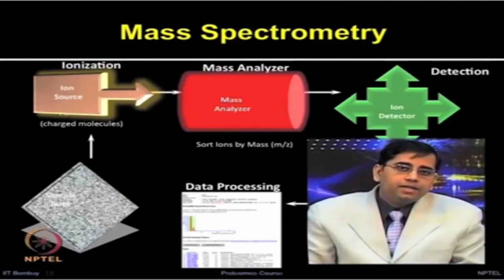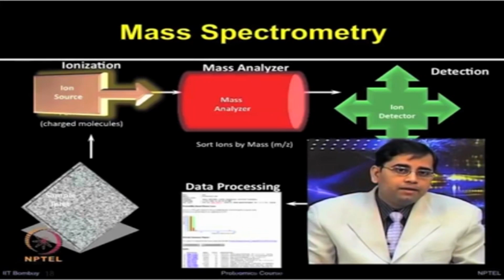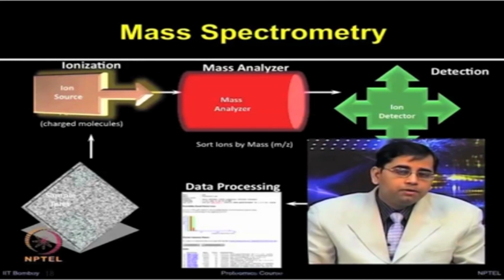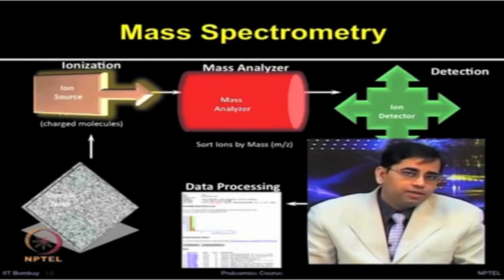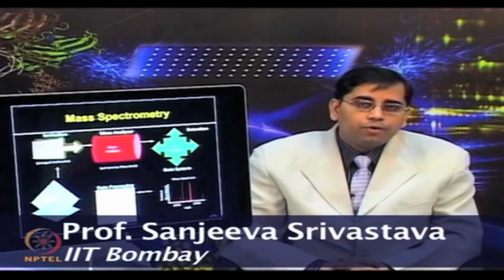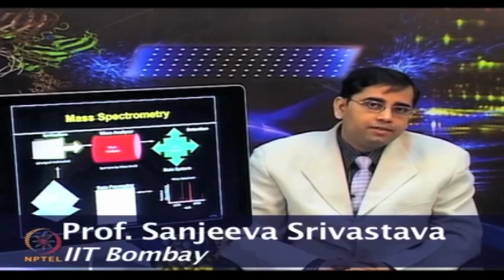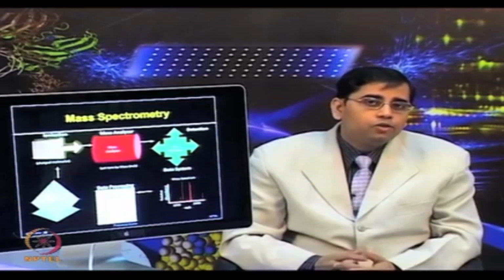Mass spectrometry is a technique for protein identification and analysis by production of charged molecular species in vacuum and its separation by magnetic and electric fields based on mass to charge ratio. Mass spectrometry has become the method of choice for analysis of complex protein samples in proteomics study due to its ability to identify thousands of proteins.